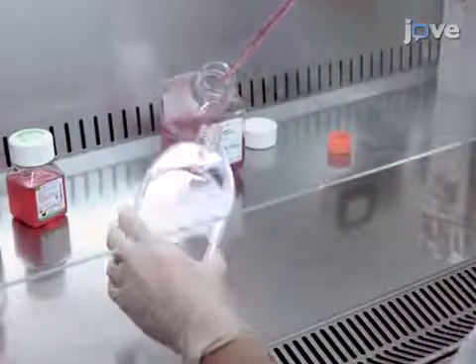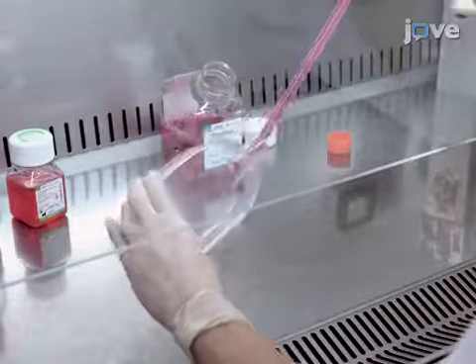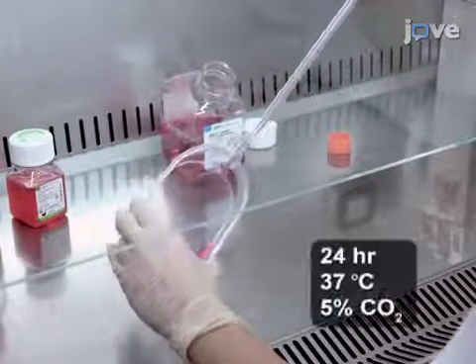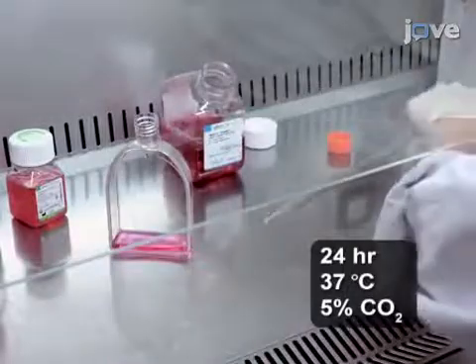In this procedure, grow the cells on 10-centimeter cell culture dishes or 75-square-centimeter flasks in culture media at 37 degrees Celsius for 24 hours.